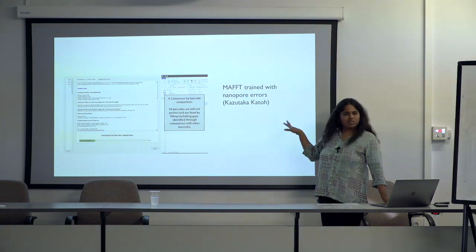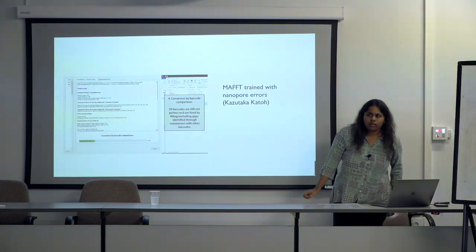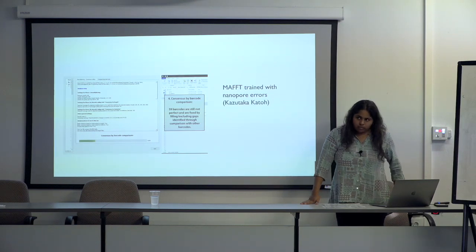Has anybody managed to reach there? So the first alignment is 82. Okay. The number of good barcodes obtained after aligning similar reads is 11.